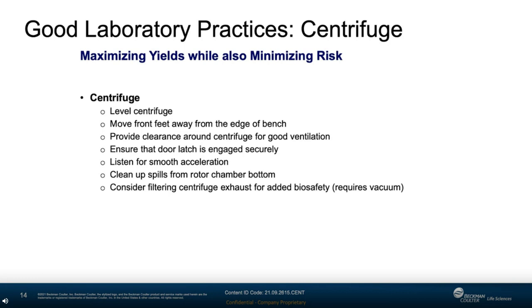When operating a centrifuge, remain near the centrifuge as it comes up to speed and pay attention for anything out of the ordinary. If you hear an unusual sound or if you feel an unusual vibration, shut the spin down. After a run, inspect the inside of the centrifuge and the rotor and clean both. Cleaning is a critical step in centrifuge maintenance, and once this becomes a habit, it's really easy to do.